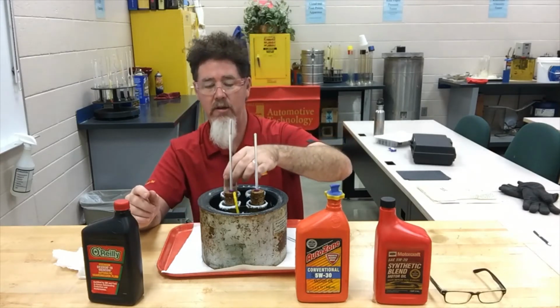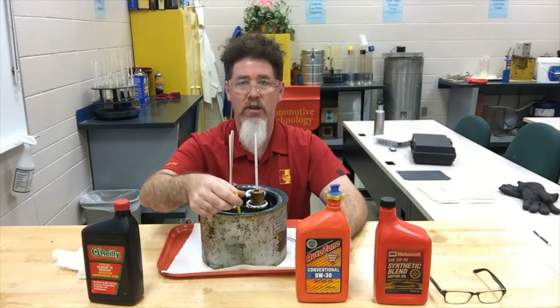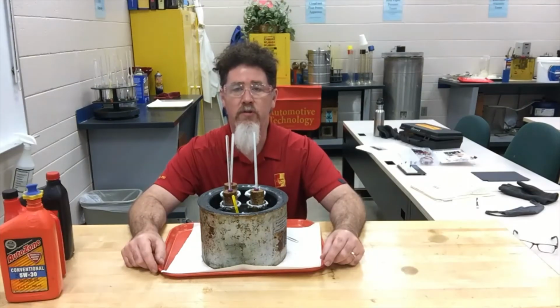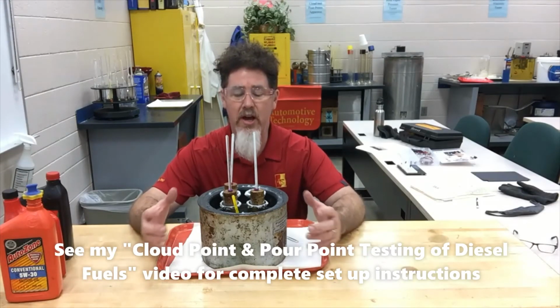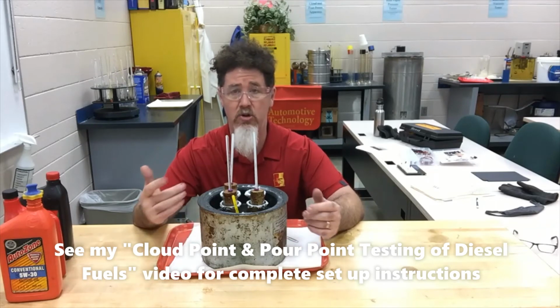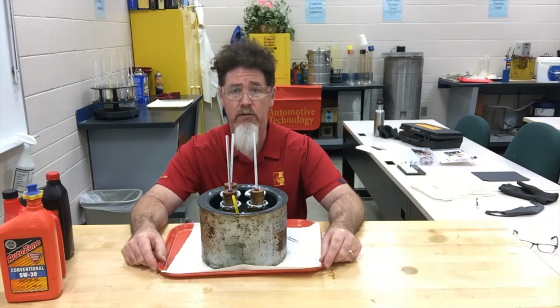We'll leave these in the bath for a few more minutes, and we'll see at what temperatures these fluids stop flowing. You can look for my previous videos on how to set up the bath of acetone and CO2 ice in a container in order to do a cloud and pour point test for your automotive fluids.